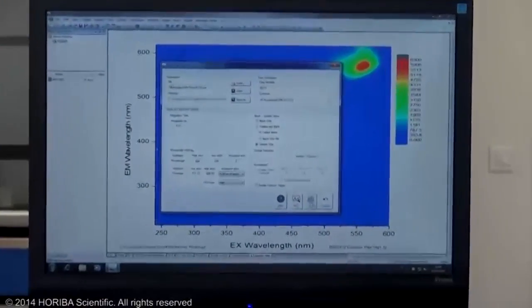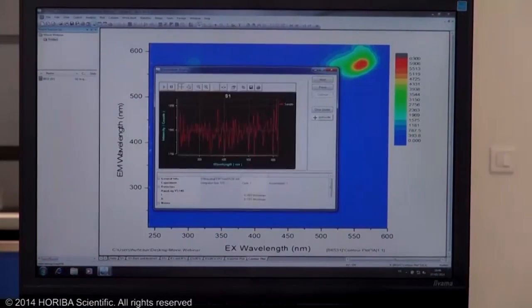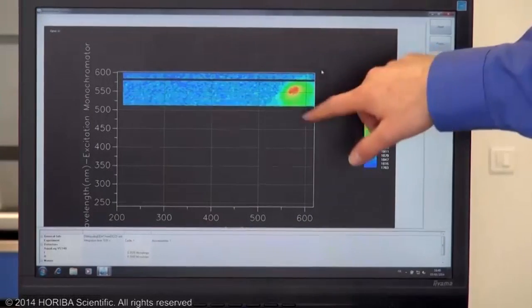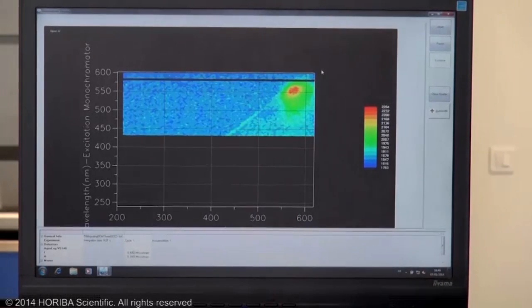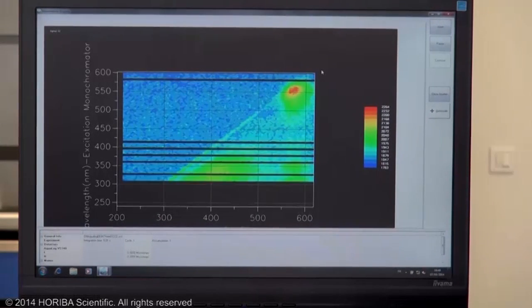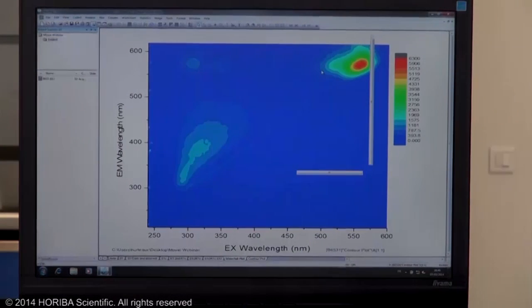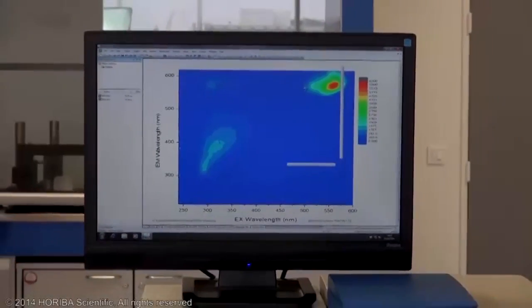So just to show you a measurement again, it's the same sample with a higher speed, and you see that we can still see the sample. Of course, it's a little bit noisier, linked to the timing, but we get the information relatively fast. Okay? So again, this is adapted to any type of sample, and this is the advantage of our background in spectroscopy.